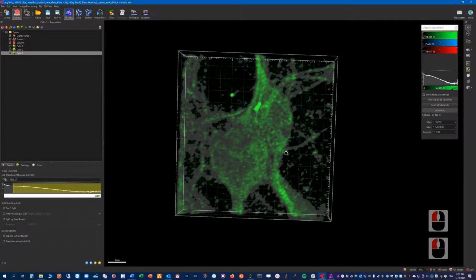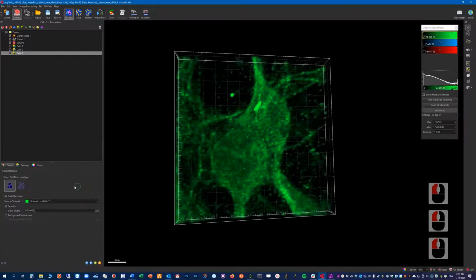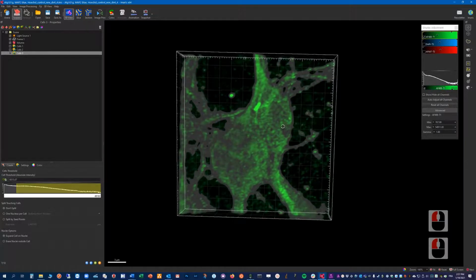So either we have to include too much or too little. So what can we do? Well, maybe if we go back, we can increase the smoothing factor. Let's use 0.2 for instance. So it looks a bit better, I would say.